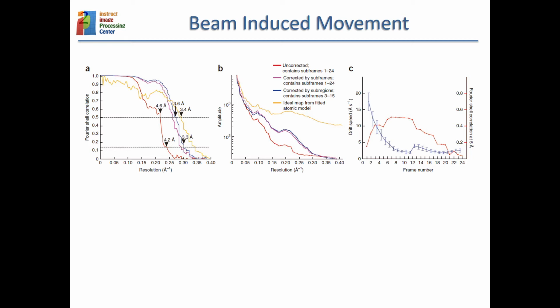So first, this dose weighting that we do at the beginning, I don't think it is the best thing, because the dose weighting somehow dampens the contribution of the frames with more radiation damage, but those dampening coefficients were measured very accurately for a particular acquisition, and they cannot be applied universally everywhere for all experiments.